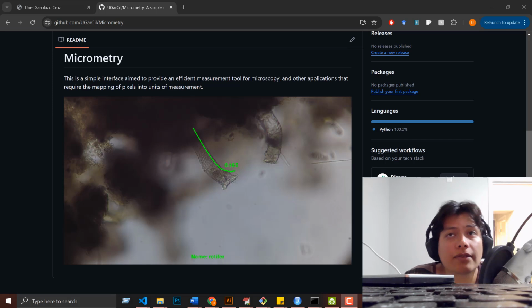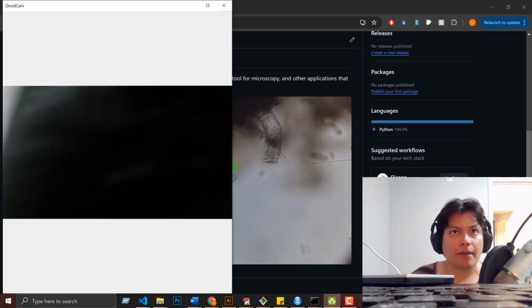So in this tutorial, I'm going to show you how to navigate the program, and I'm going to show you how to install it as well. Among other things, we also need to talk about the equipment that may be good to have. I'm going to introduce you to some links where you could get some additional hardware that could help you in your projects. So let's start with the setup.